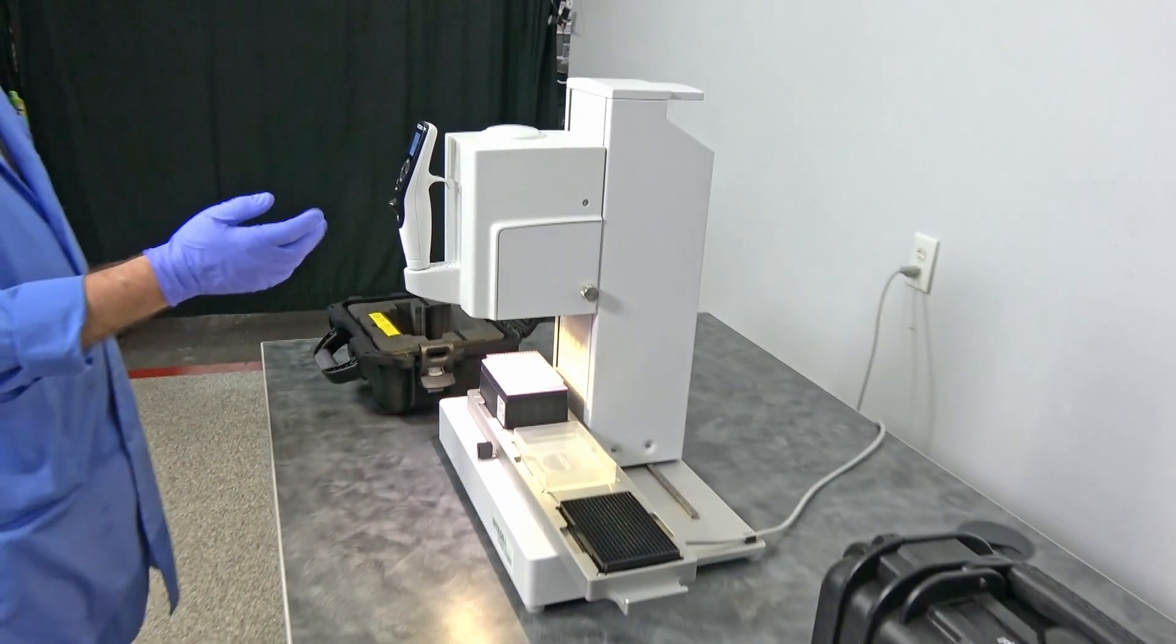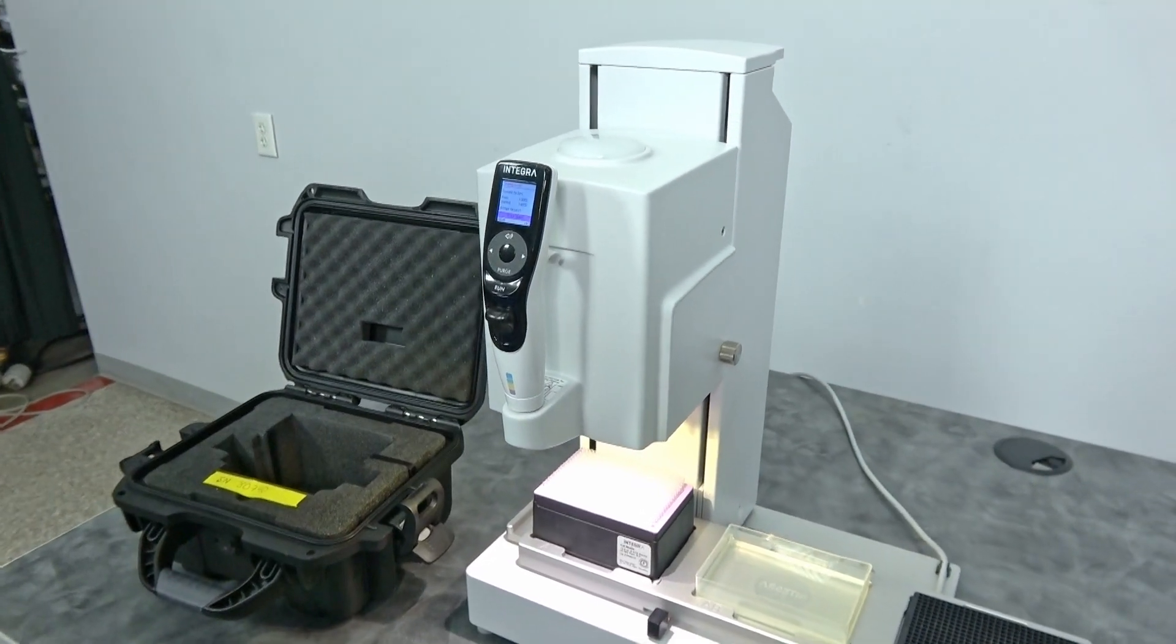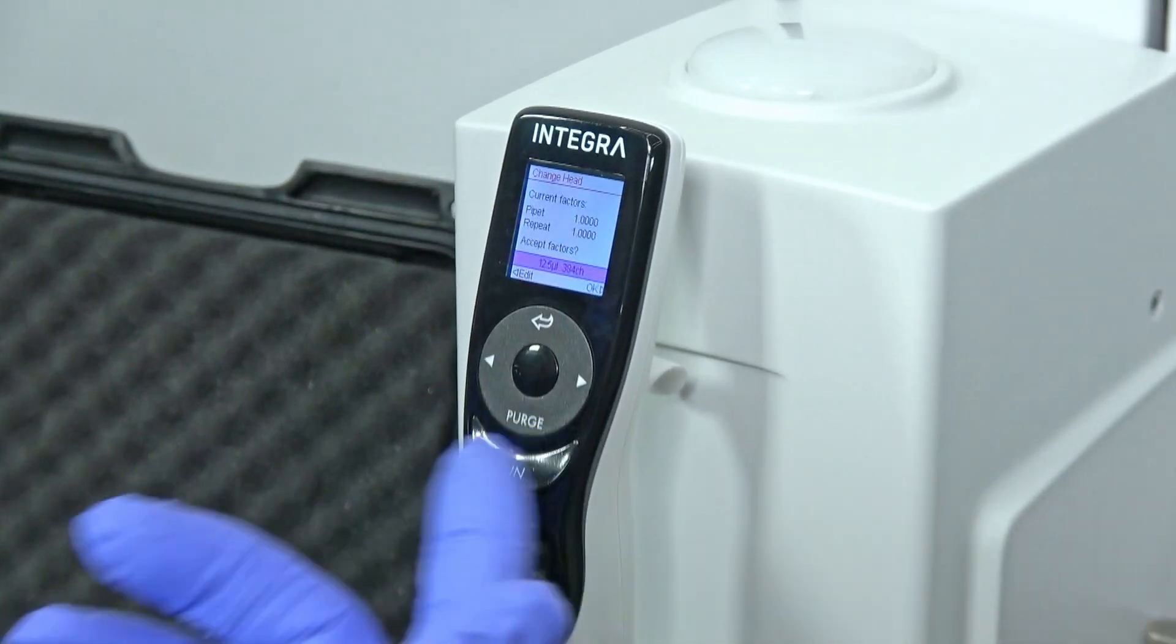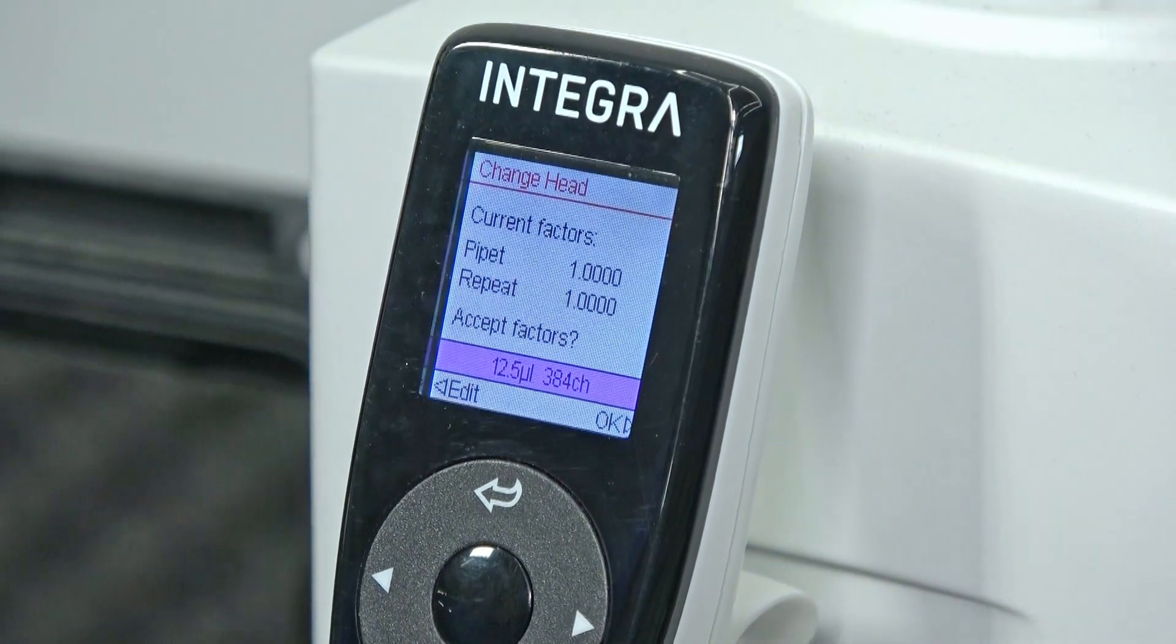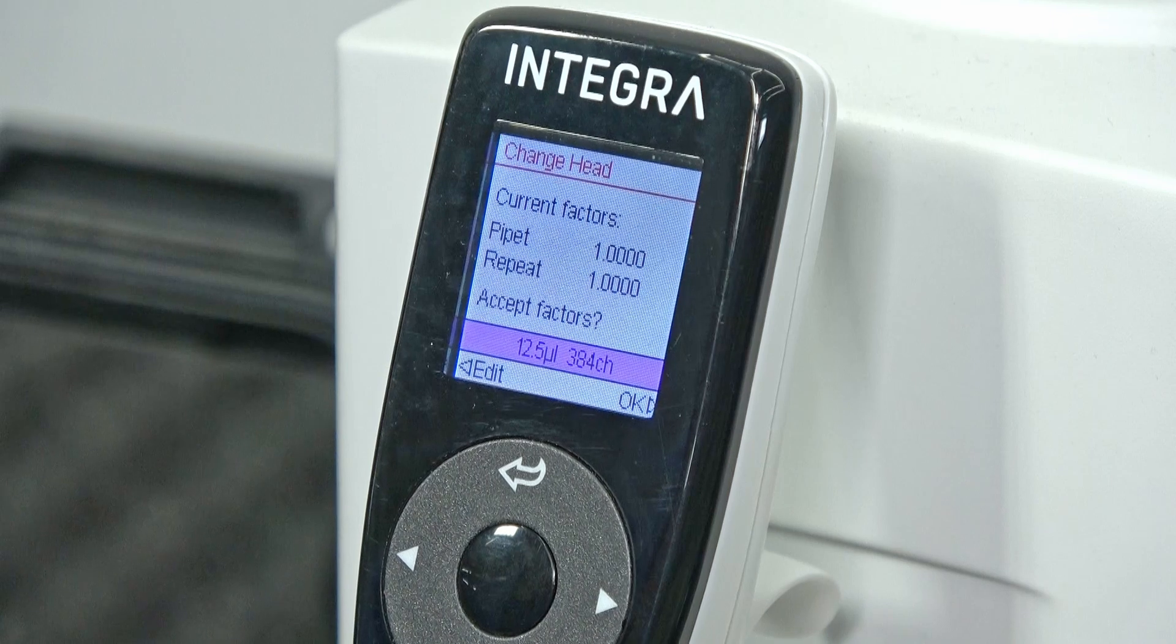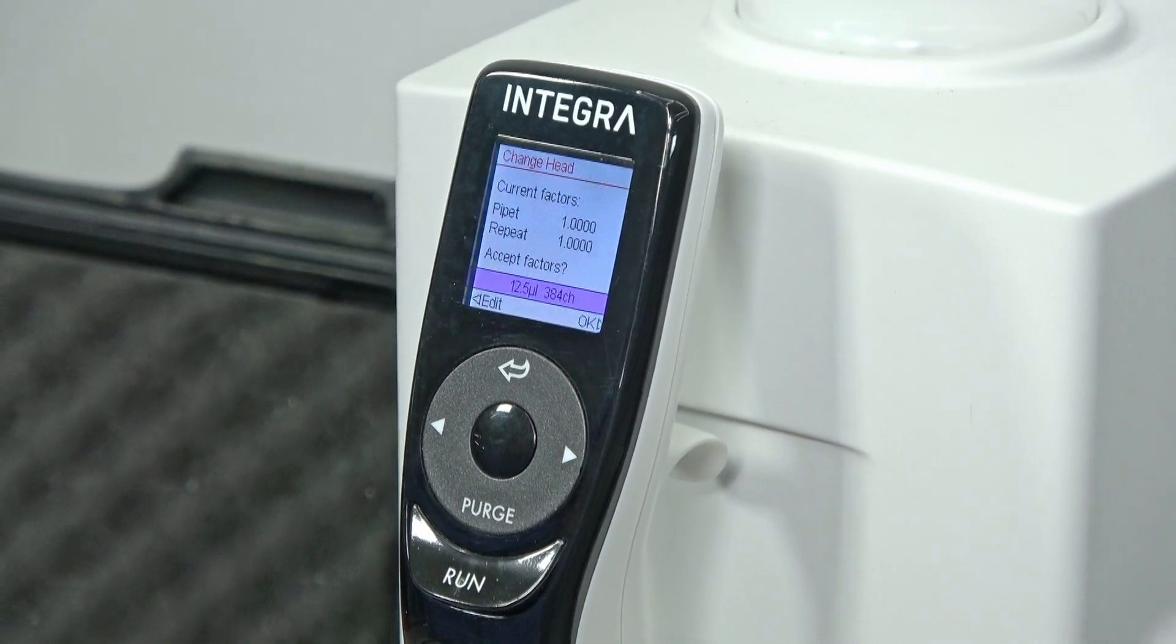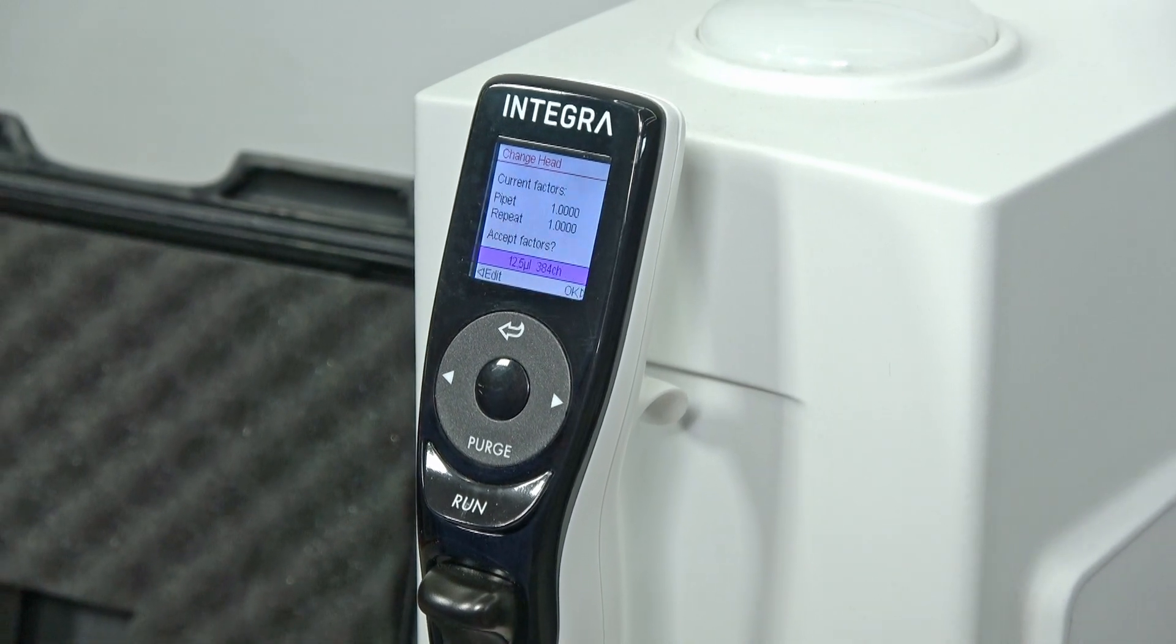And then you can again press run and then it's going to ask you if you want to accept the current factors. I'm just going to push okay here where it says okay, push the button, and it's going to initiate and get us ready to aspirate and dispense.